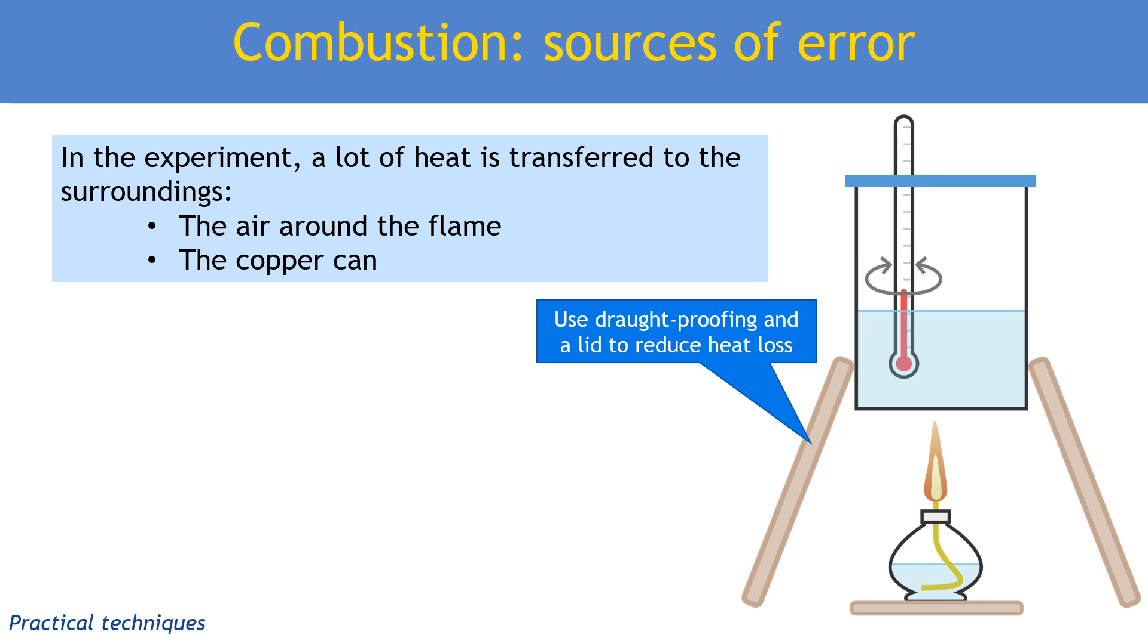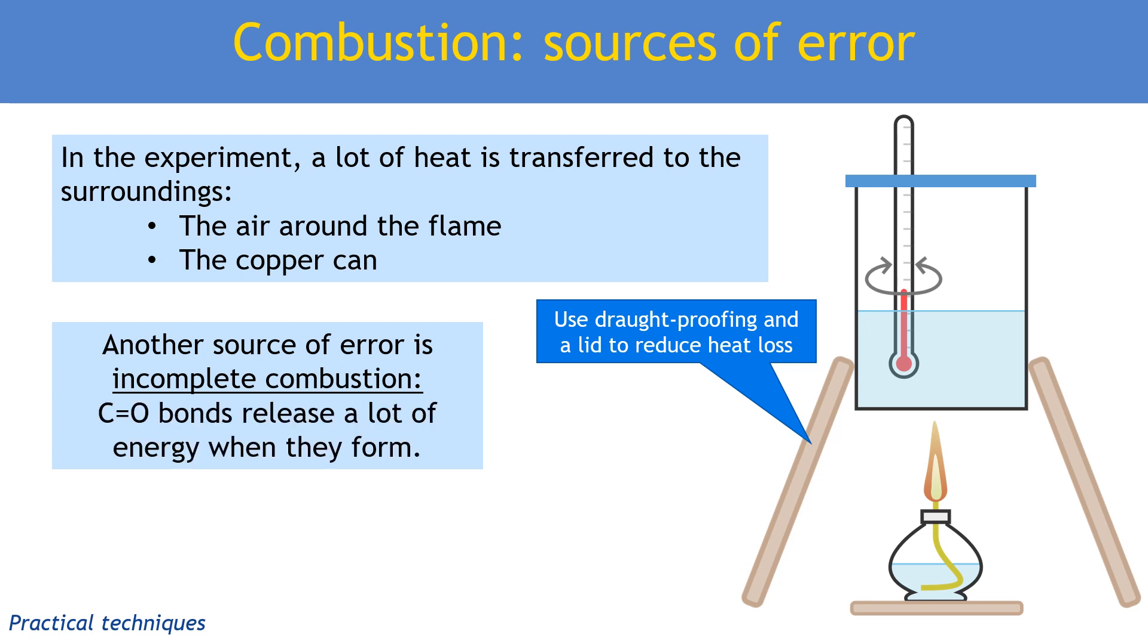Another big source of error is incomplete combustion of the fuel. This is particularly a problem for higher molecular mass fuels that don't burn as cleanly, making more carbon and carbon monoxide. You can see that by the buildup of soot on the bottom of the can. A lot of the energy released in complete combustion is due to the high energy of the C=O bonds made when we make carbon dioxide. If we make carbon or carbon monoxide instead, we're not making as many of these C=O bonds and not releasing as much energy.